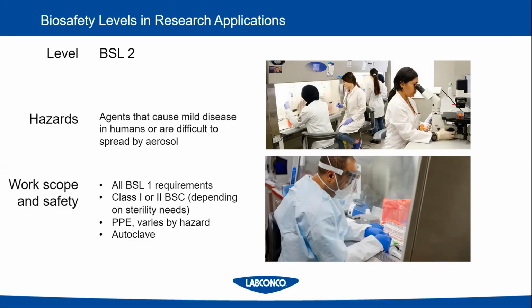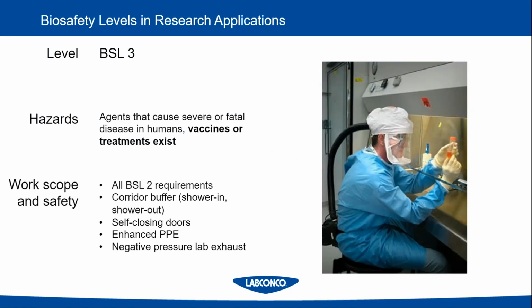On the bottom, though, you see a researcher with much more serious PPE. He could be working with clinical samples or samples of viruses or bacteria that could cause illness, and that's why he has a higher level of personal protective equipment on.